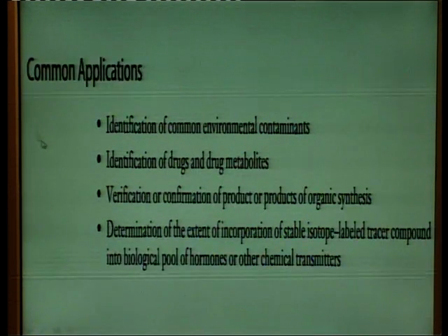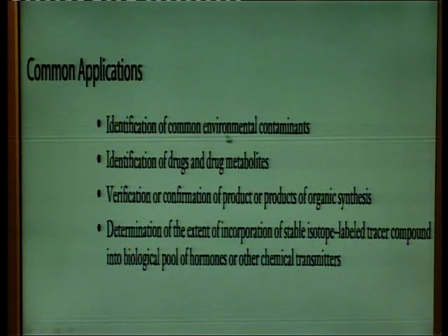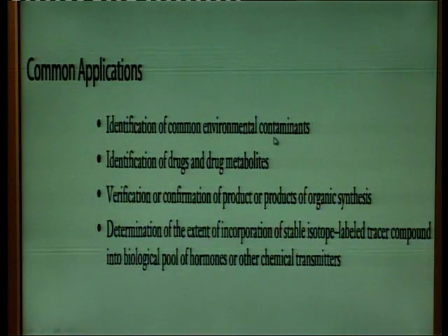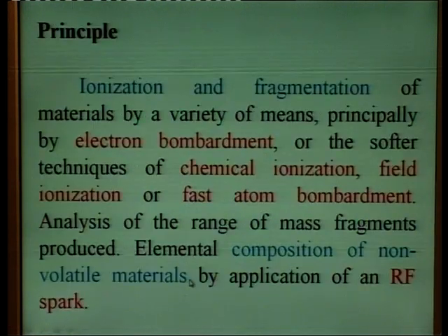Now, its common applications: they are used to identify common environmental contaminants, to identify drugs and drug metabolites, the verification and confirmation of the product of organic synthesis, and tracer studies, that is the incorporation of stable isotope labeled tracer compound into the biological pool of the hormones or chemical transmitters.